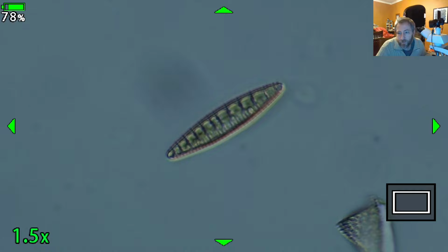So Ribozoid asked, how do I process them? Most of the time for diatom samples, you can see diatoms if you just take a piece of mud and smear it on a cover slip, and then put a little bit of water on it and stick it on a glass slide. But the organic matter in the slide kind of gets in the way of everything, and we don't want that. The little bits of mud and everything else are mostly made of organic matter that we're trying to get rid of so that we can see things like the diatoms more clearly.